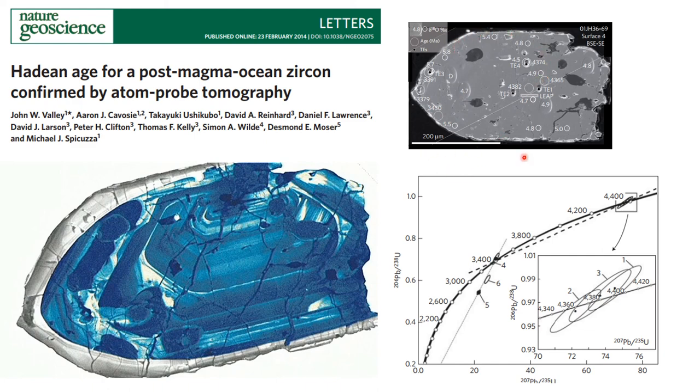You might just be able to make out that the ones on the outside are 3.391, 3.43, 3.379. These are younger than some of the ages in the middle, which are 4.382, 4.374, 4.365, so 4.4 billion years. They've also measured some oxygen isotopes using SIMS on this as well, to try and find out something about the conditions in which the zircon formed.